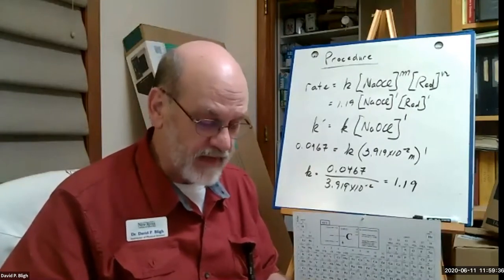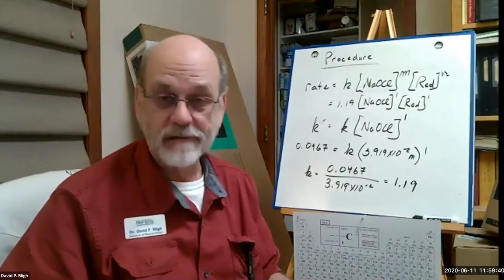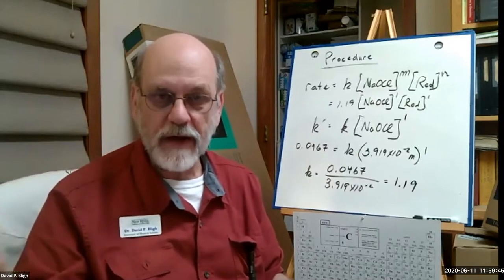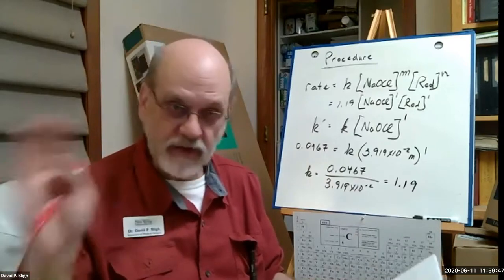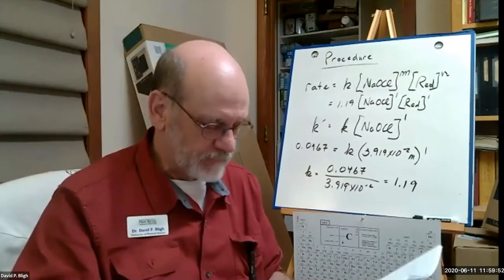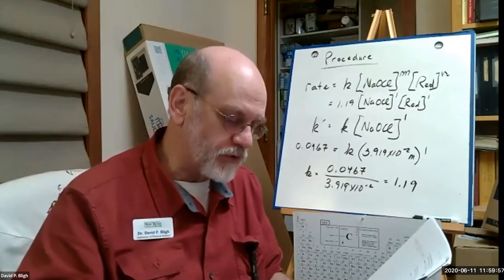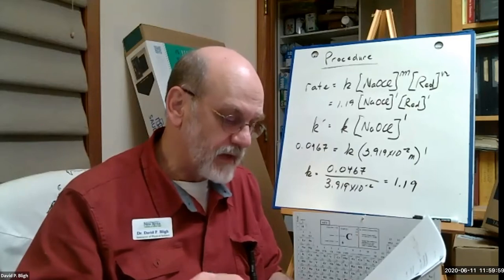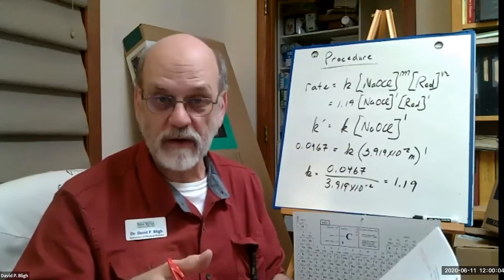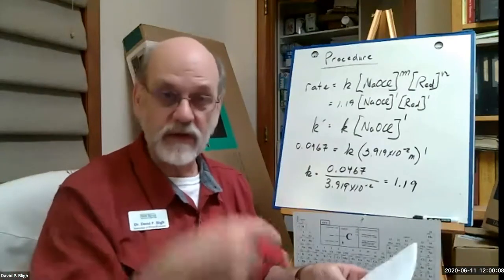Post-lab question 1. The data in this experiment obeys the Beer-Lambert law. Explain this law, right? So you saw the Khan Academy video that explains the Beer-Lambert law. Just put it in your own words. Number 2. Why is equimolar sodium chloride solution used to dilute sodium hypochlorite in the second trial, in the half-strength trial, instead of distilled water? I already gave you that answer, right? So if you don't remember, go back and look at it in the video.